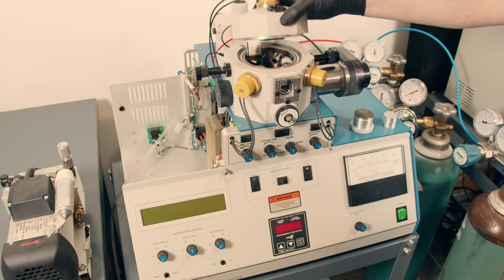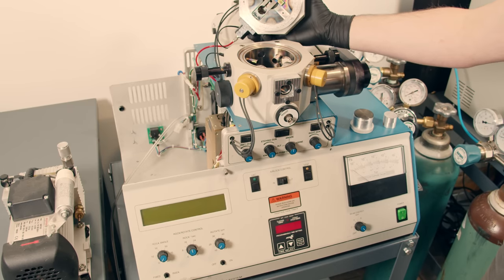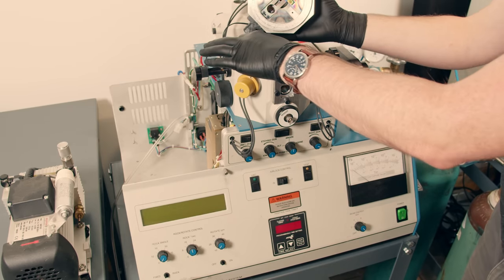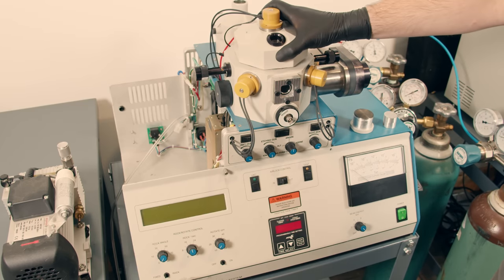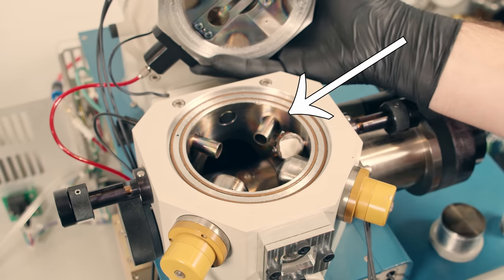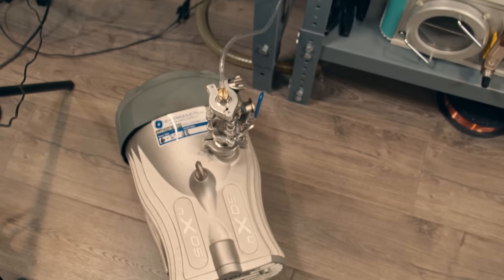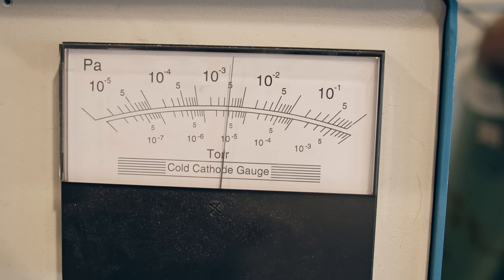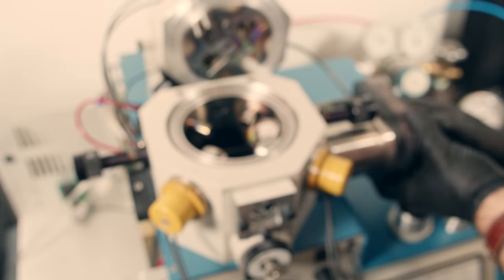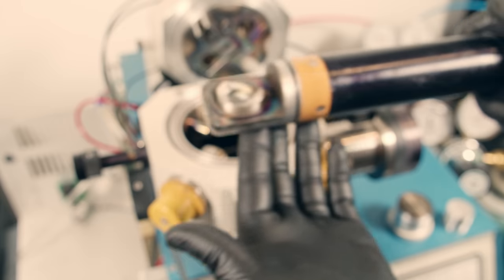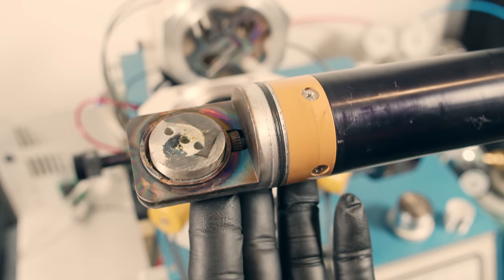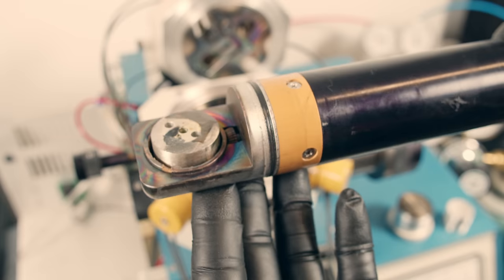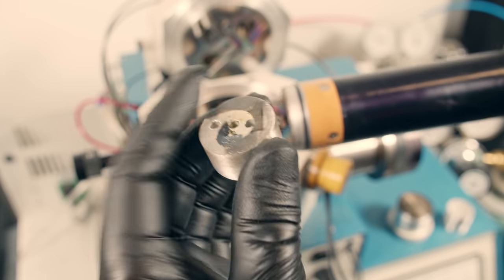It looks complicated, but that's just because there are some weird design choices on this particular instrument. It's actually a pretty straightforward device. There's a vacuum chamber here which holds your sample. A rough vacuum pump and a turbomolecular pump both work to bring the chamber down to a high vacuum level. The sample is supposed to sit on a stage that both rotates and rocks back and forth, but mine is missing that. So it just sits on these little cylinders of metal that I made.